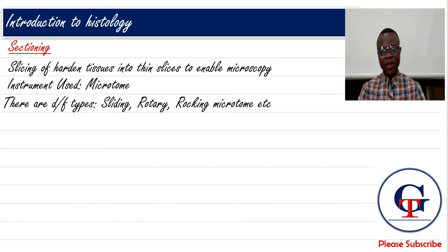So after preparing our tissue, we now carry out a process known as sectioning. This helps us cut our tissue into thin slices that enable us to observe the tissue under a microscope. Mind you, there are different thicknesses for different observations, as you will see in your lab.